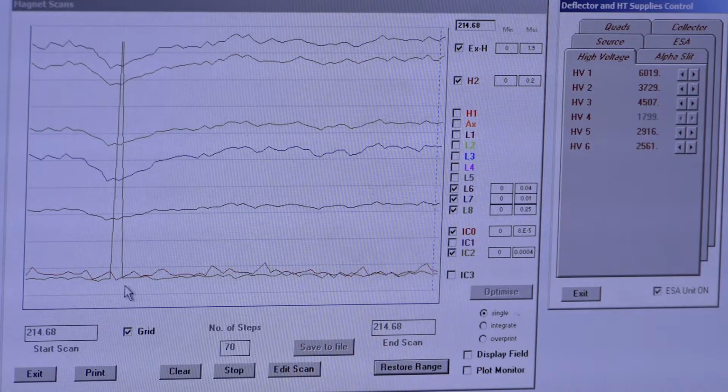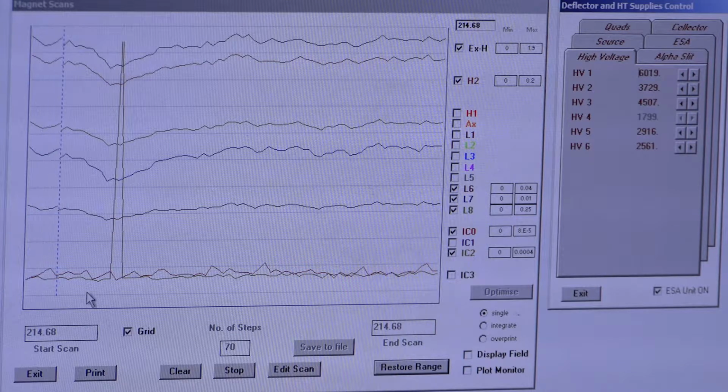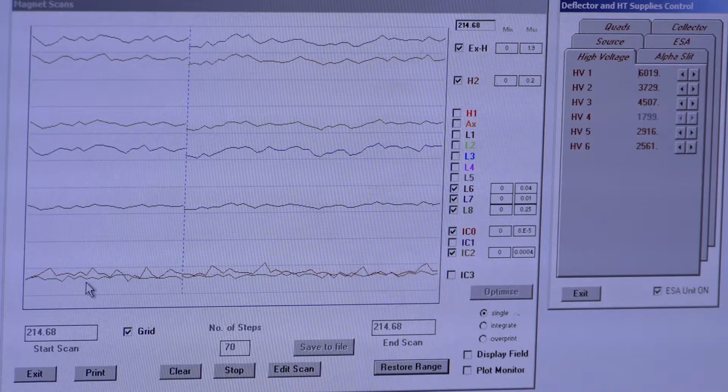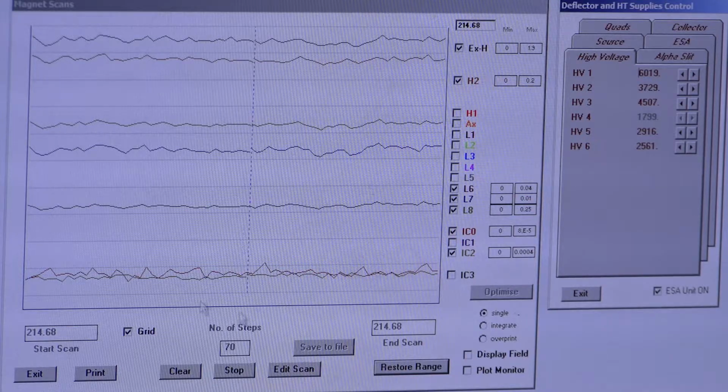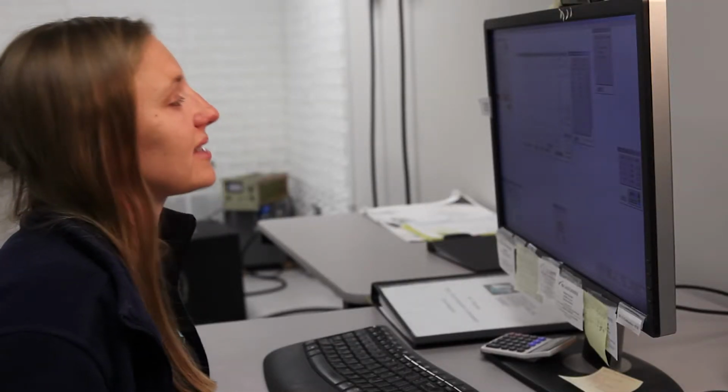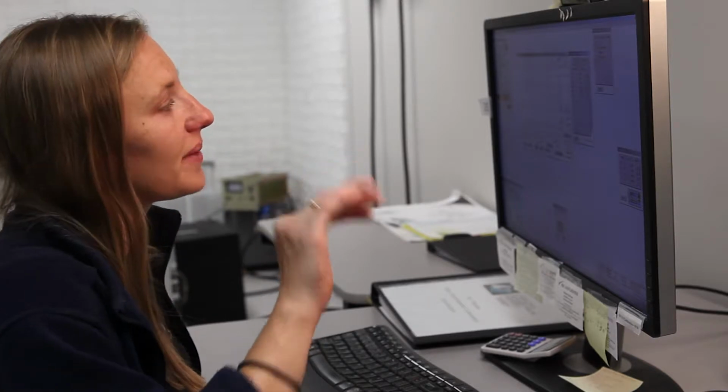These spikes happen again along the crystal. Since it's a heterogeneous crystal, there's different sections of the grain with different chemistry. You'll see some spikes for certain elements. So I see 2 spikes, so that's a 204 spike. And in general, our ion counter peaks for Faraday routines are very noisy anyway. So I just make sure they're underneath our major masses and that they're fairly flat, even though there are going to be a lot of noise in there.